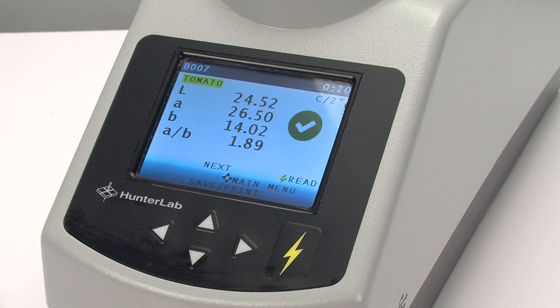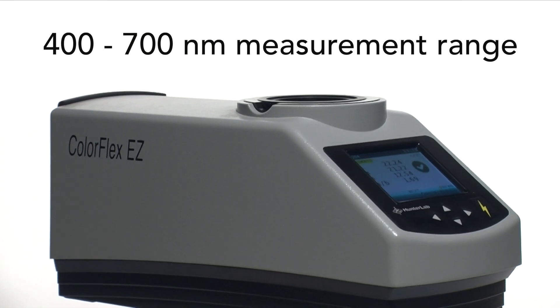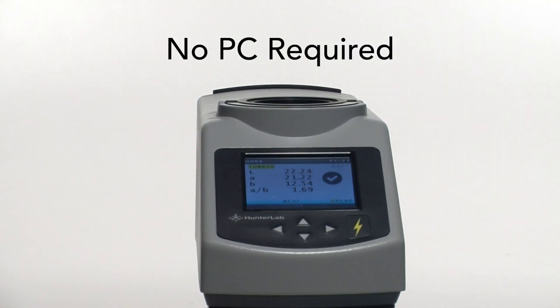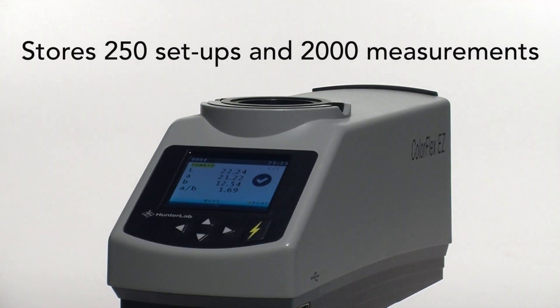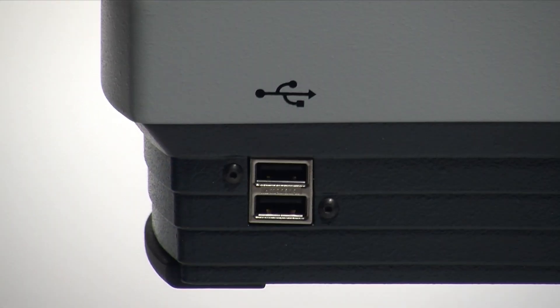Technically, it is a full visible spectrum — 400 to 700 nanometers — spectrophotometer, using 45/0-degree geometry. No PC is needed for operation. Its onboard processor provides storage for up to 250 separate measurement setups and 2,000 sample measurements, and data is easily transferred via USB.